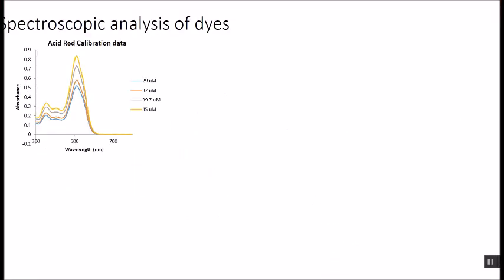Okay, let's get started talking about how to analyze a mixture of solutions. And the simplest case we're going to work on is a spectroscopic analysis of dyes. So let us imagine we're working with two different dyes.